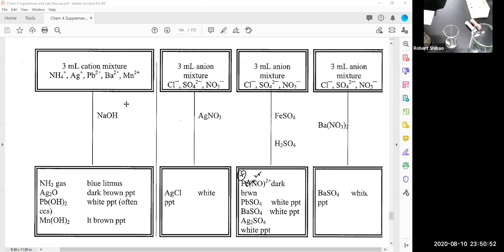Somebody put labeling tape on this, so I'll just write on the labeling tape. You don't need a Sharpie to write on the labeling tape. And so I'm just keeping the pipette clean here. That's for unknown A, and I'll just use it for unknown A. Because we're going to test unknown A, I need more sample of unknown A as well.